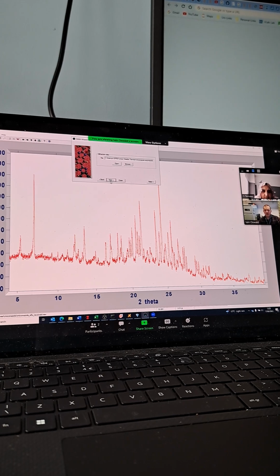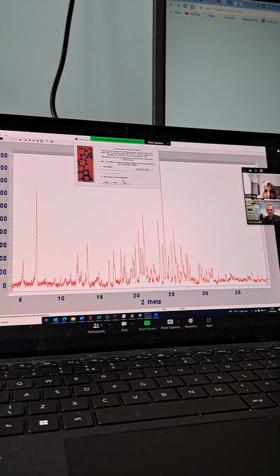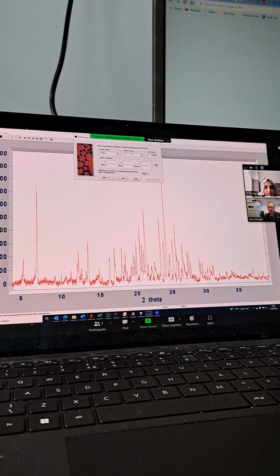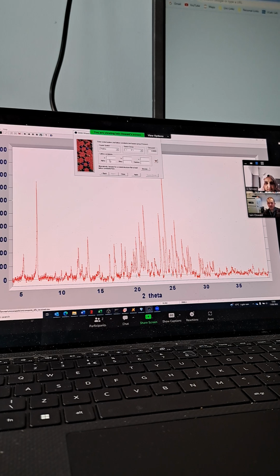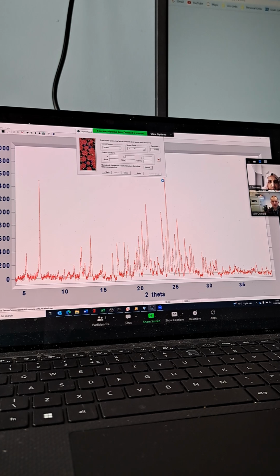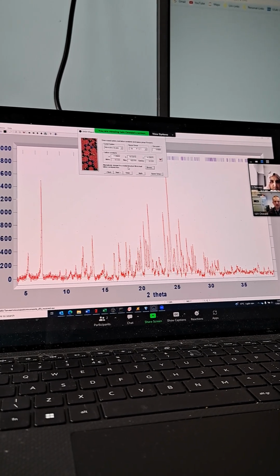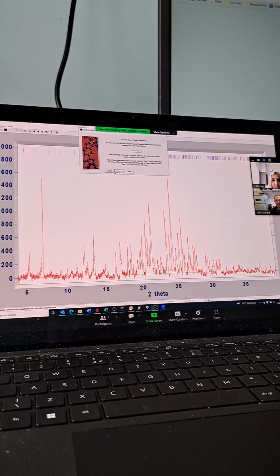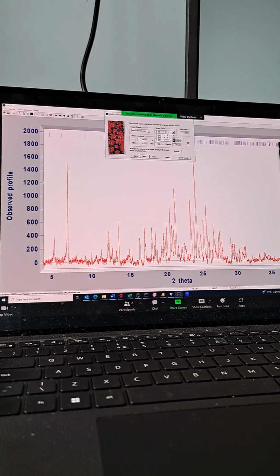Okay, so here's your file. We can click through most of this. What you'll want to start to do is add in known cell parameters, and then you can type in the cell parameters or copy and paste them into here. Now, I'll just put in this, for example. That's PIP, I don't know whether that's right or not. It doesn't look to be the right thing, but that gives us the unit cell parameters in here. And you want to choose the correct space group.